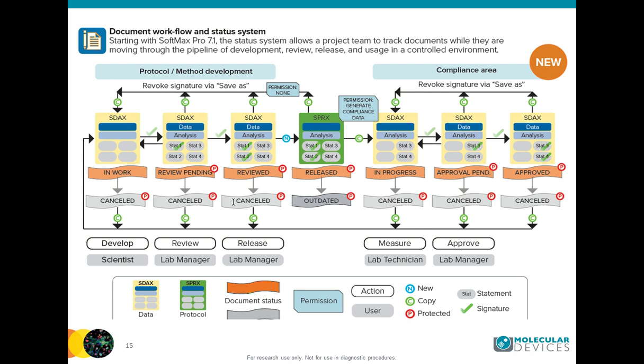You're able to add a number, a date, or a time, which will automatically be updated in order to differentiate the different files. But as soon as the lab opens up the middle, the green protocol, it will be automatically saved. So this is the meaning of autosave. And what you were used to in the versions before is now called auto export.